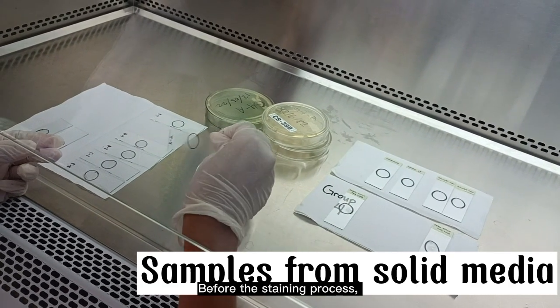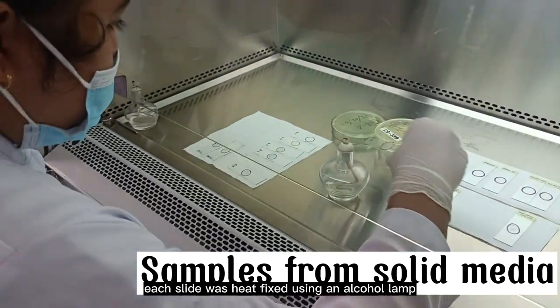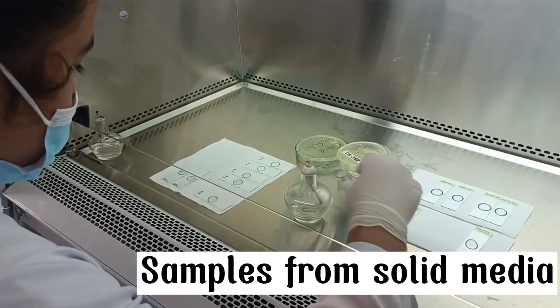Before the staining process, each slide was heat fixed using an alcohol lamp and cooled down.